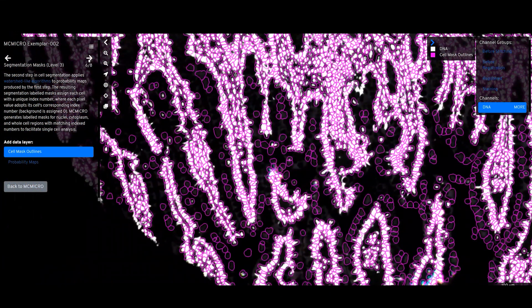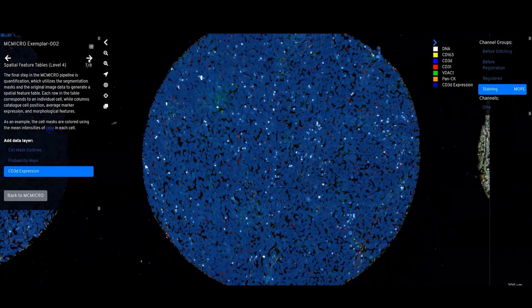From here, MCMicro writes intensity and shape information about each cell to a feature table.